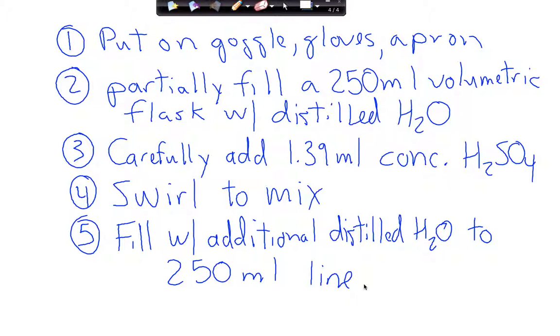Now, guys, let's talk about why. This is obviously not distilled water, but the idea is this. When you mix acid in water, it is a very violent exothermic reaction. So much so that if you were to carry out this process, you actually wouldn't be able to hold on to the vessel. It would get so warm. It's very, very exothermic. And actually, if it happens quickly enough, the solution will boil. And if it boils, it's going to go everywhere.